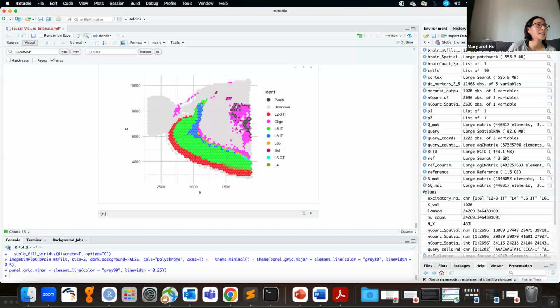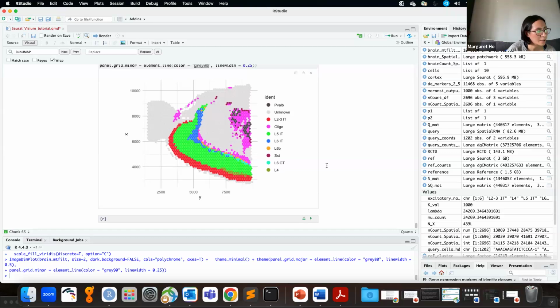But if you were to analyze things like Xenium data, where maybe you only have 150 genes, you'd really want to be doing that also. So you want to be actually figuring out what the cell identity is, and so you want to be running RCTD with that to really identify what the cells are before you make any comparisons between them.